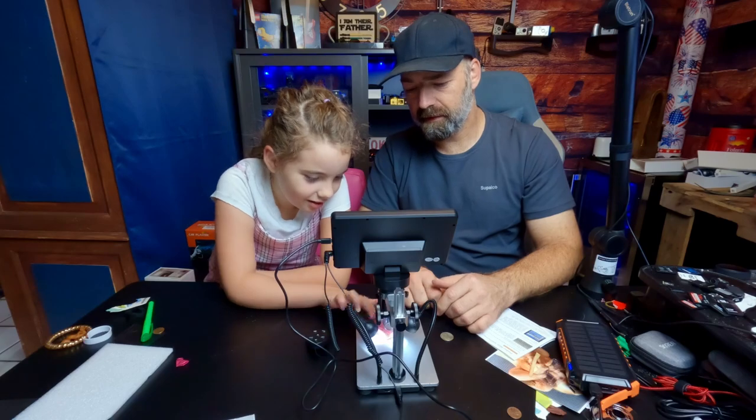This can be used to grade coins and look at coins up close. You can use it for science experiments and to see the world up close. Next we looked at a pink eraser — it looks like toothed bubblegum. As you can tell, it's pretty easy to use. Lizzie Jo has only played with this for about ten minutes and she's already got it all figured out.